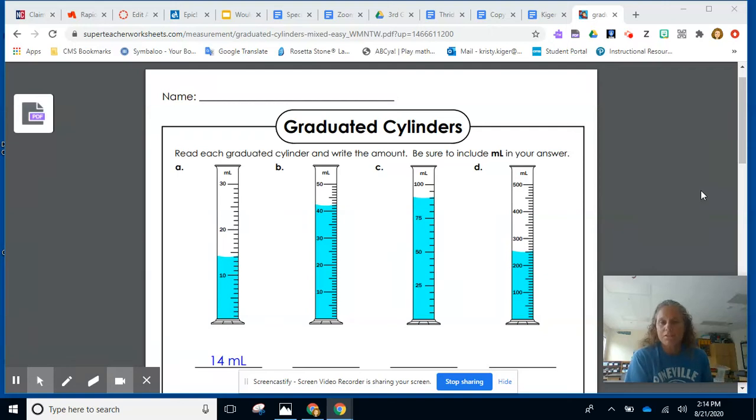Hey boys and girls, this is Mrs. Kiger, and I'm here to talk to you about graduated cylinders as a tool that scientists can use when measuring different types of liquids in their science lab, kind of like a measuring cup that you would use at home if you were cooking or baking.